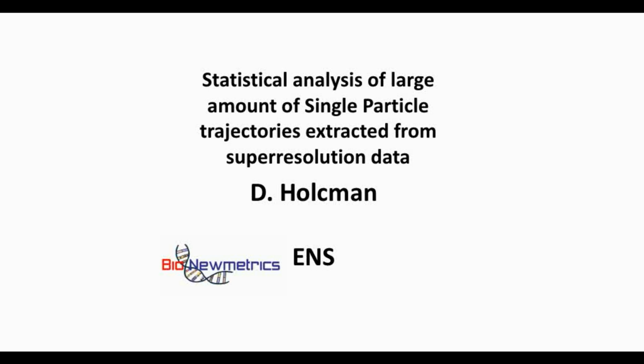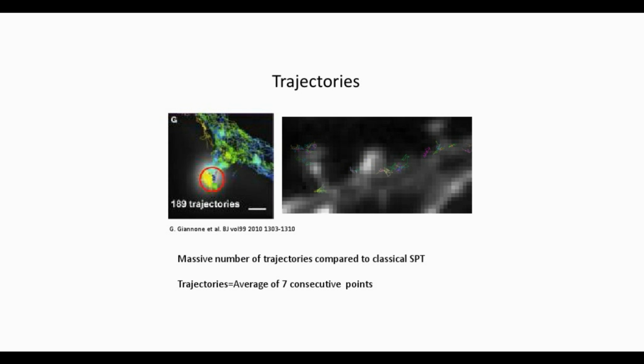So the goal of this lecture is to present statistical methods to analyze a large amount of single particle trajectories. Those trajectories are usually extracted from data, and here I'll focus specifically on super resolution. So what is the statistical framework under which it is possible to analyze the data? Let me first introduce the data.